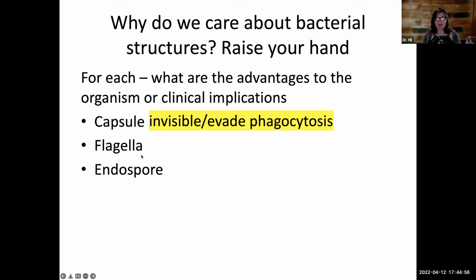The other thing, and so you'll want to go back and review the prep on this and also make sure you're paying attention when we learn about it again in chapter 4. But flagella are important in two ways as diagnostic tools. So one way is they can help us to look at the pattern of flagella, which is somewhat distinctive sometimes.